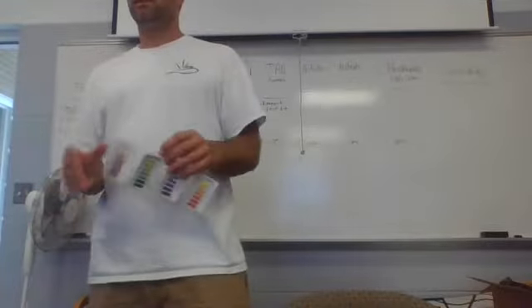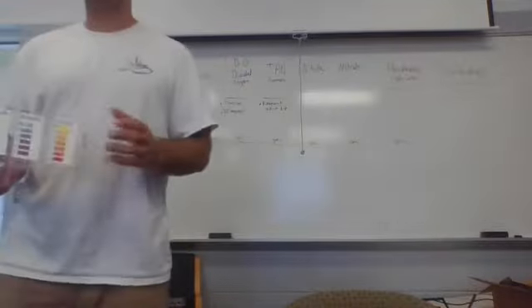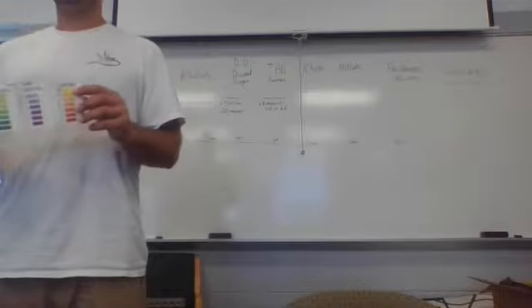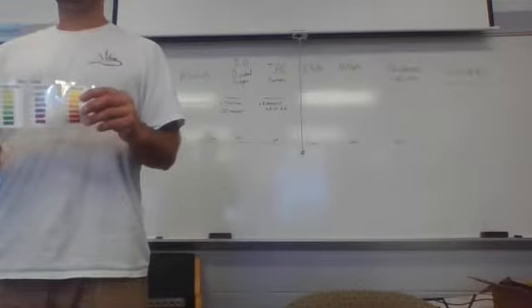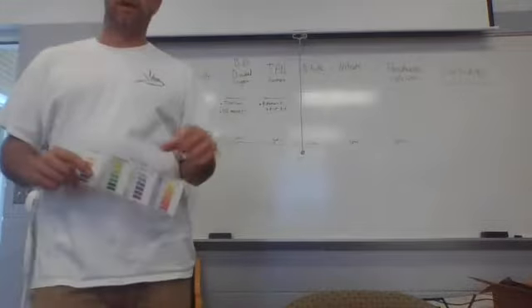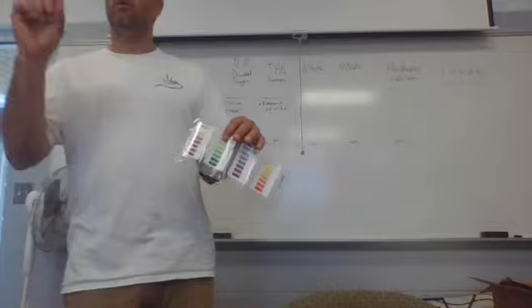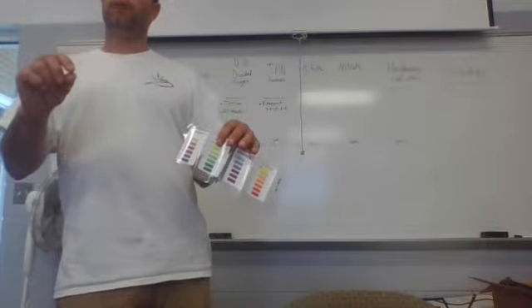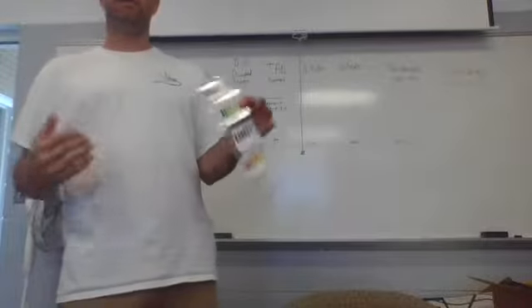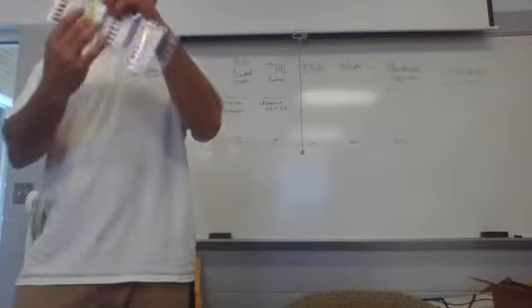How would you adjust if you had a high concentration and you wanted to know exactly what it was? What would you do before you tested? You dilute it with 50% deionized water. Okay, so you make a dilution factor. So maybe it's 50%, maybe it's 1 milliliter of sample into 9 milliliters of deionized water, and then you multiply your answer times 10. But you dilute so that you come down into the test range.